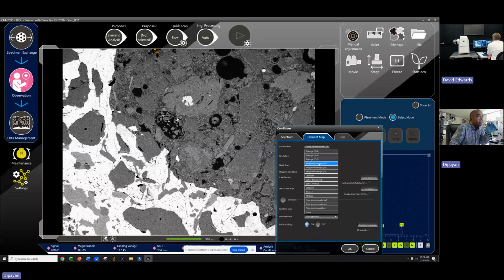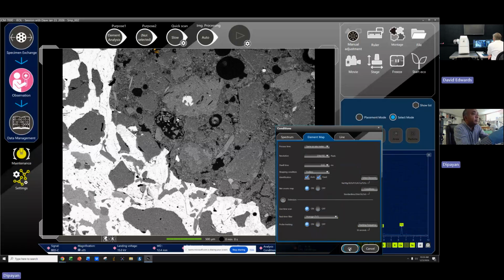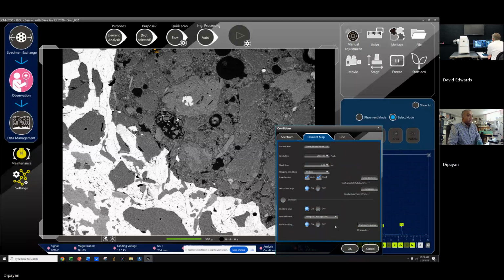Some people prefer the edge preserving small. I'll go there and see. I'll show you, because we can change that while the image starts forming. Okay, so 5x5 and 7x7, I wouldn't do either of those. It's going to make everything soft. I would use the 3x3. No, not 7x7, not at all. That's the one. You want weighted, not the regular 3x3. I do weighted, but you can do either one. You can always do it during collection, so it's up to you.